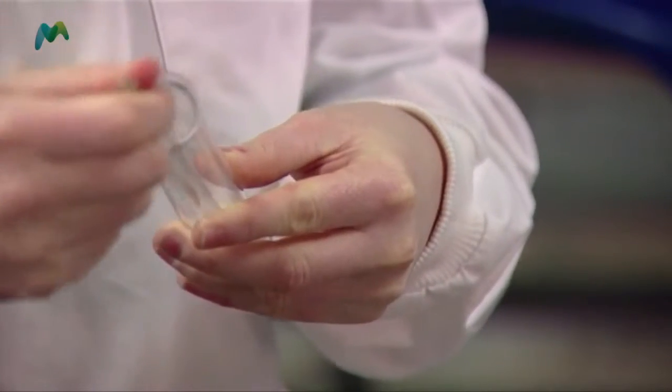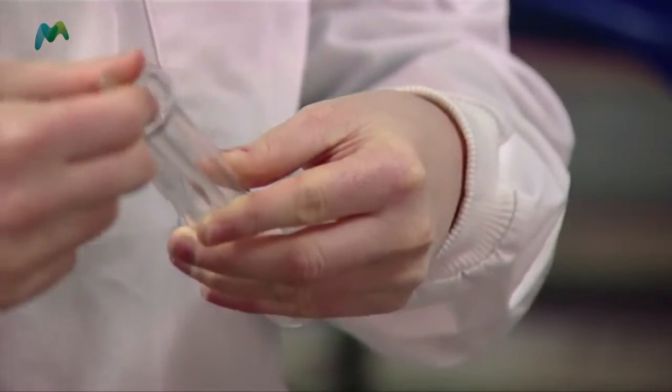That's now ready for autoclaving. Let's see if you can do yours. I'll get my cotton wool plug — good, and I've noticed you've got it the right way round.